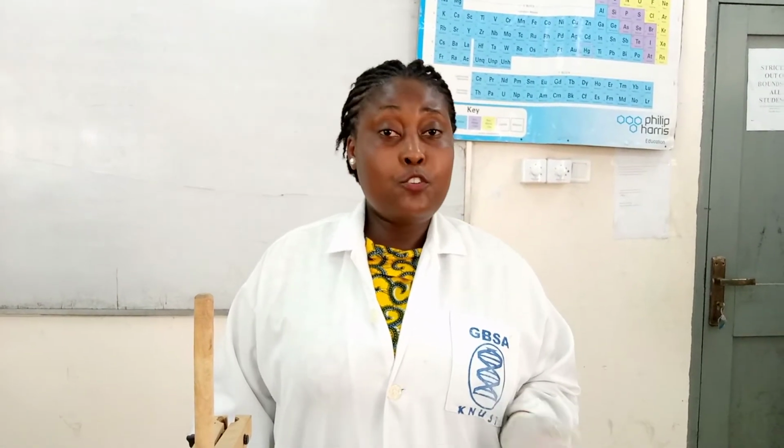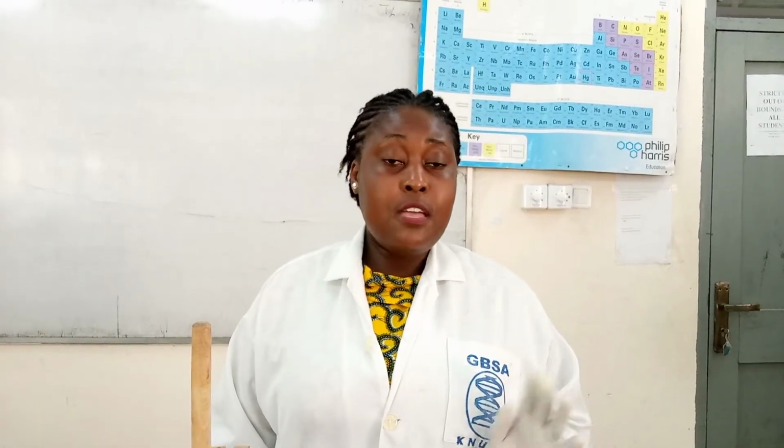to determine its purity. In the last video I talked about chromatography, but today is melting point determination.